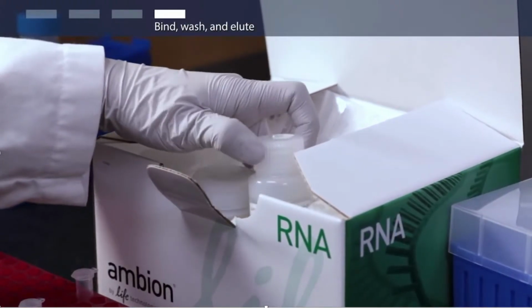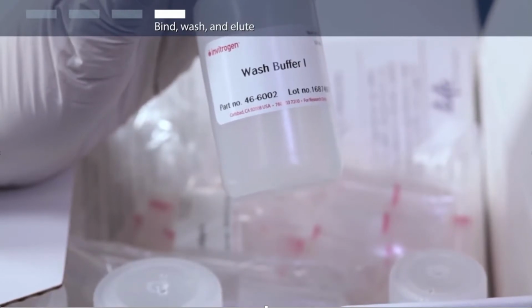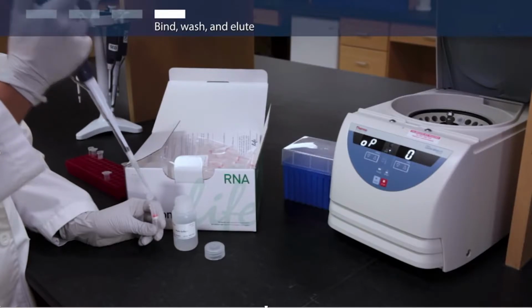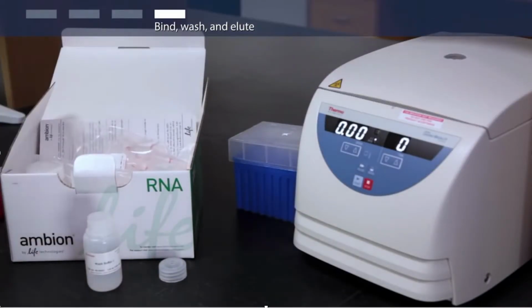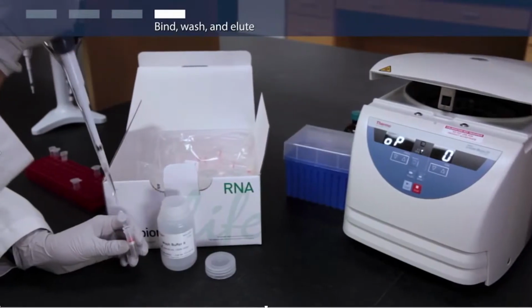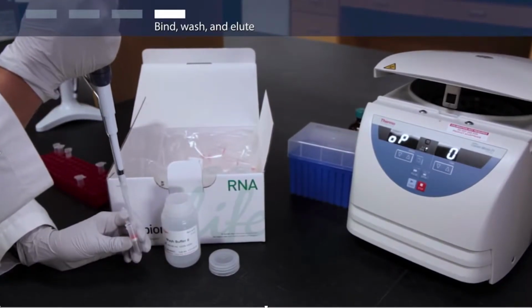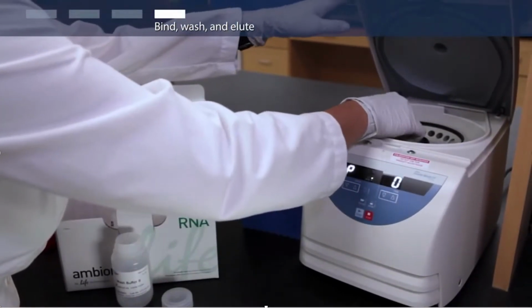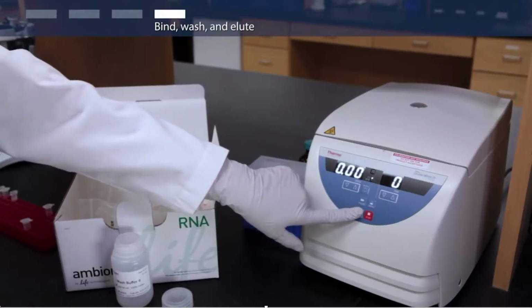Wash your bound RNA by adding 700 microliters of wash buffer 1 and centrifuging at 12,000 G for 15 seconds. Discard the flow-through and the collection tube. With the silica membrane column in a fresh collection tube, add 500 microliters of prepared wash buffer 2 and centrifuge at 12,000 G for 15 seconds. Discard the flow-through and repeat.